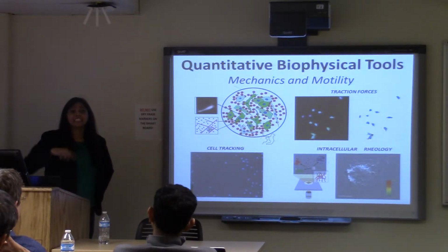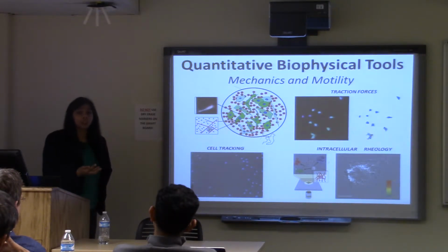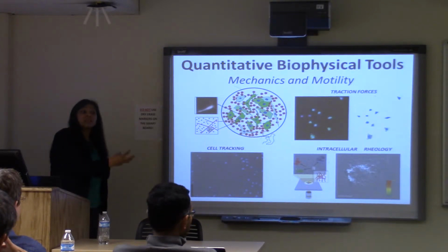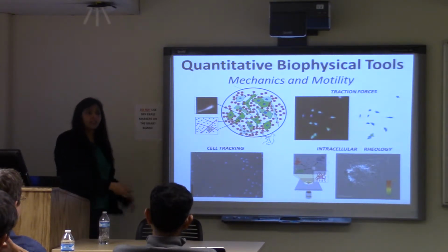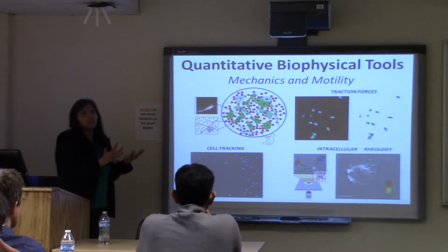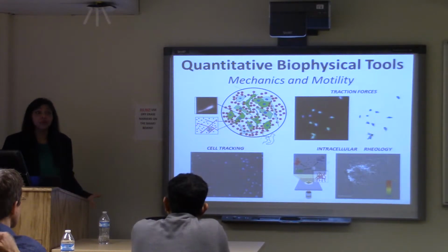And this is an image of cells that are labeled with a dye that is reduced in intensity as the cells undergo division. And so we can also use probes of different functional parameters so that we can determine whether there are things that we can add to our understanding. So not only are we looking at mechanics, but we're looking at cell proliferation, which is really critical in cancer cells that are undergoing more rapid division than normal cells.